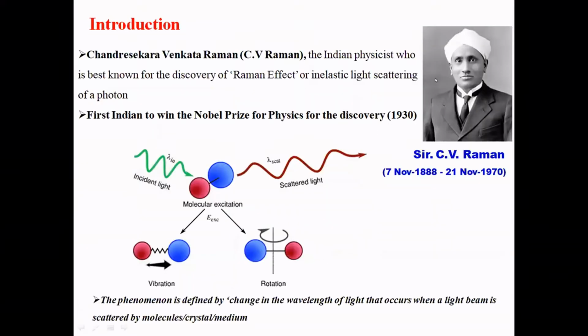So Raman spectra is based on the Raman effect. As we all know, the discovery was made by our own scientist, Sir C.V. Raman, in the year 1930. So he established this concept based on the inelastic scattering of light.